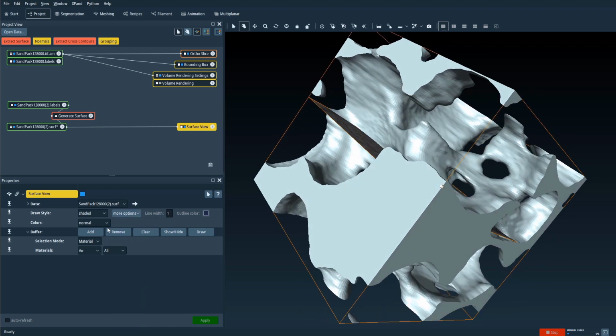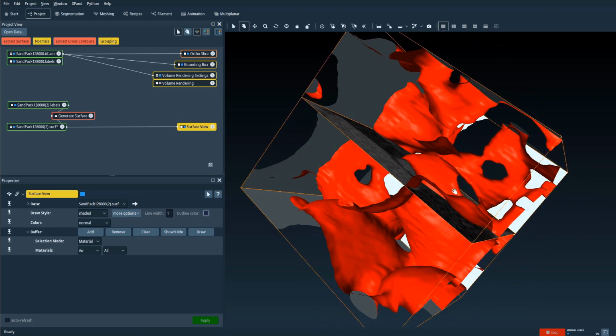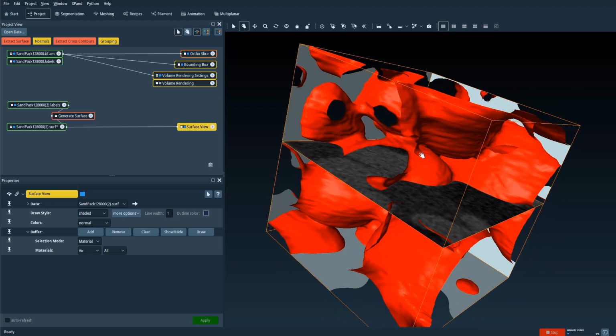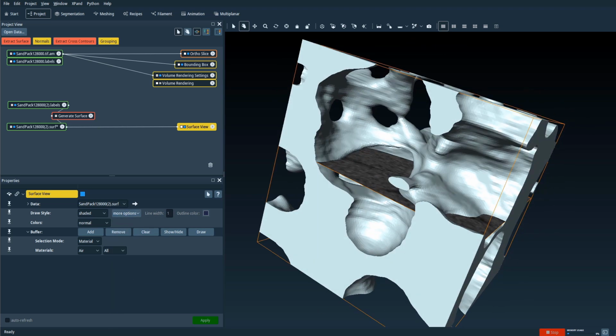Because if, for instance, your renderer by default does not render back faces for optimization purposes, you'll see something like this, which might look weird depending on your object. So just keep that in mind, and we'll get back to that later on in the workshop. Okay.